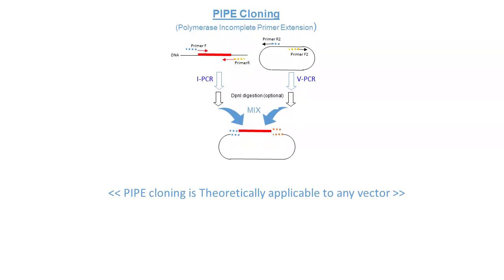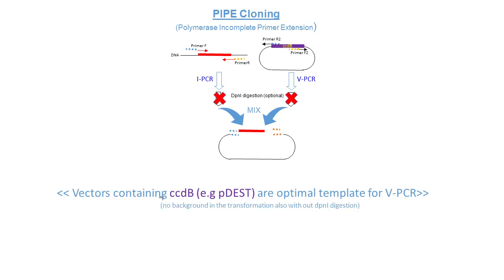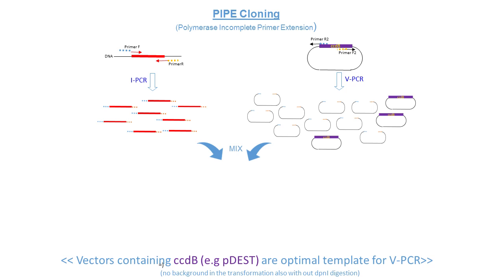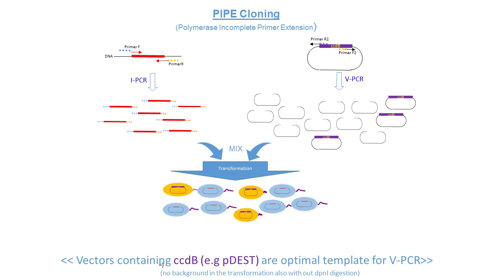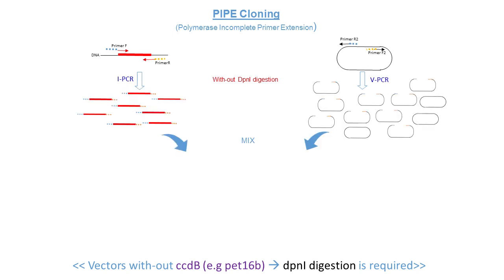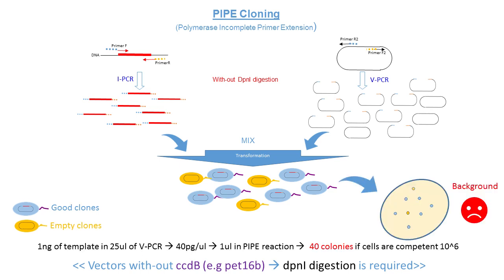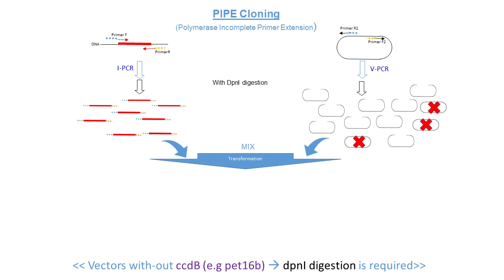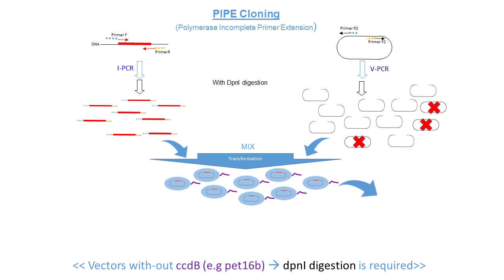PIPE cloning is theoretically applicable to any vector, but vectors containing ccdB, as for example the pDEST vectors used for the Gateway cloning approach, are optimal templates for the vector PCR because the presence of ccdB is able to reduce the background due to the template vector to 0. On the other hand, when we are using a plasmid that does not contain ccdB, we can use other strategies to remove the background. One possibility is to use DpnI digestion, because DpnI is able to digest methylated DNA, so it digests the template plasmid extracted with a mini kit from E. coli culture, which is methylated, but it is not able to digest your PCR product.